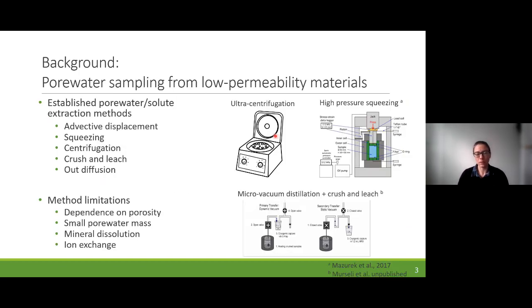There are several methods that exist for extracting and characterizing pore waters from low permeability materials. These include advective displacement, high pressure squeezing, ultracentrifugation, crush and leach, and out diffusion. All of these methods come with their own sets of limitations. Many are dependent on external porosity measurements.